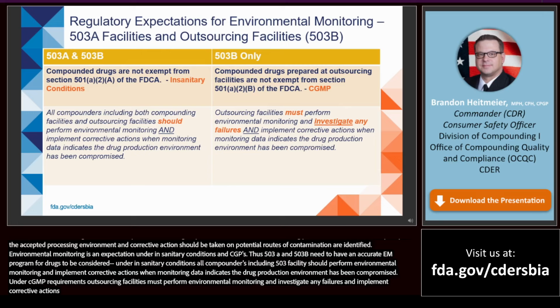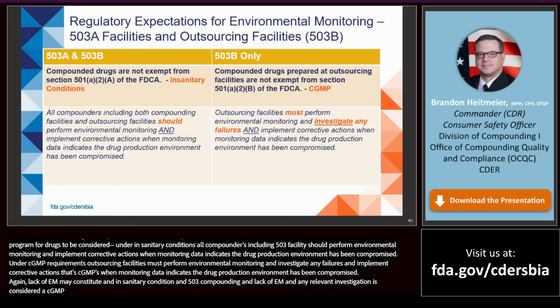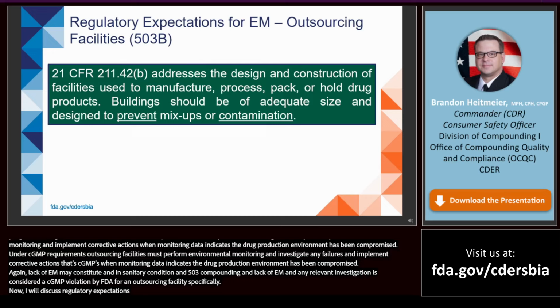Again, lack of EM may constitute an unsanitary condition in 503A compounding, and lack of EM and any relevant investigation is considered a CGMP violation by FDA for an outsourcing facility specifically. Now I will discuss some regulatory expectations for EM as it relates to an outsourcing facility.